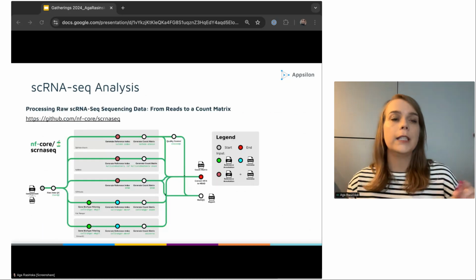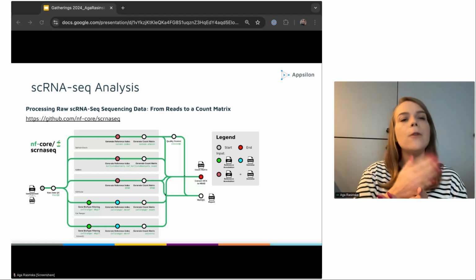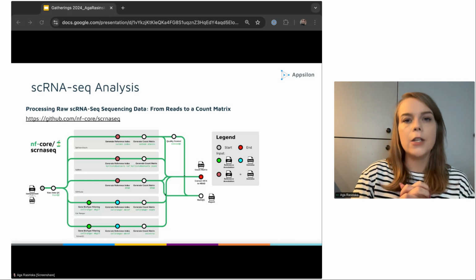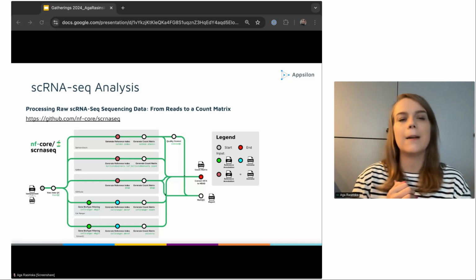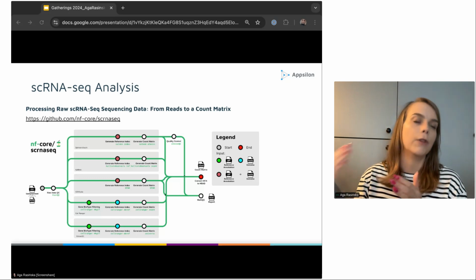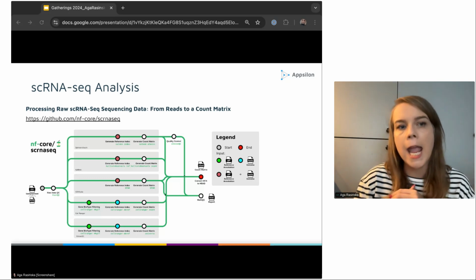But it's not only that. If you look slightly at how the analysis goes, which steps are there, you can already see other challenges that might be addressed using automated workflows, rather than a step-by-step approach.